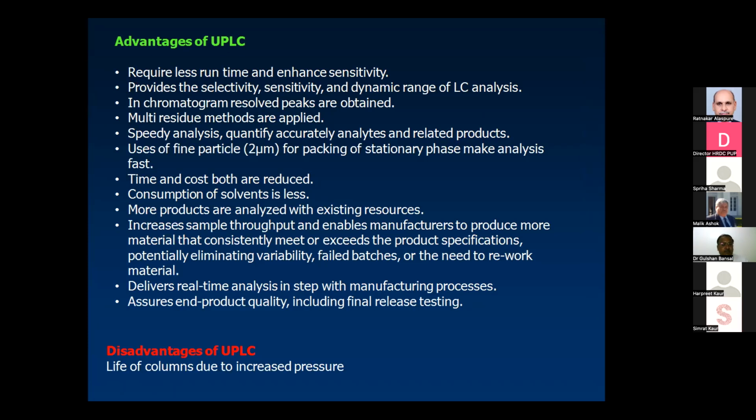So the disadvantage, there is only one disadvantage, that is the life of the columns, because the life of the column depends upon how much back pressure it is experiencing. Because particle size is very less in case of UPLC, the back pressure is high, so the wear and tear is very high, and that leads to early spoilage or early death of the column. So column life is very less in comparison to HPLC. So that is the only disadvantage. Otherwise, it is all advantage.